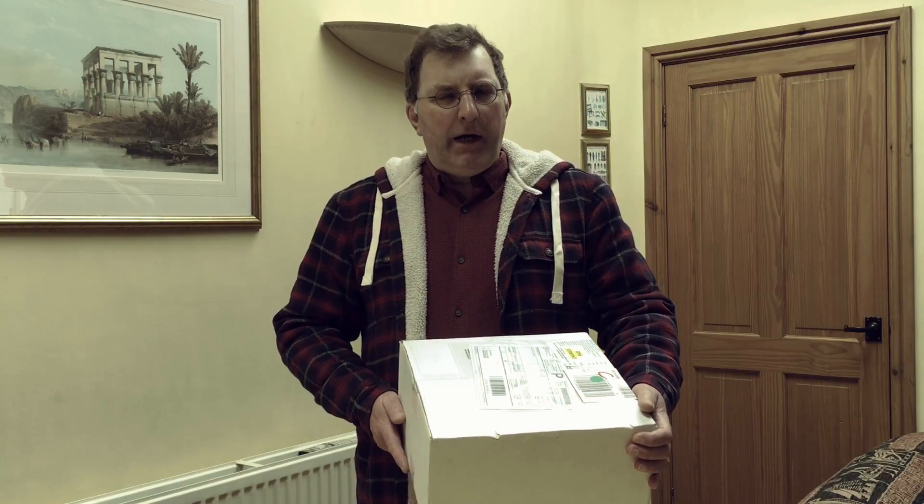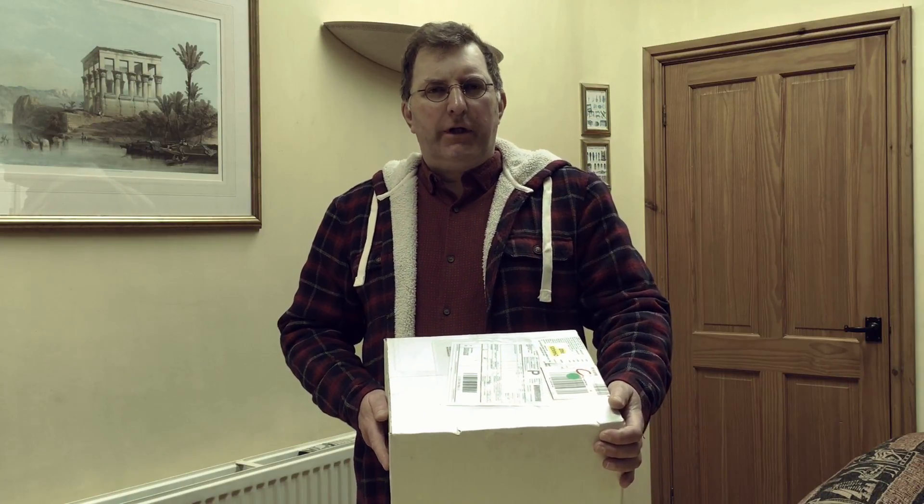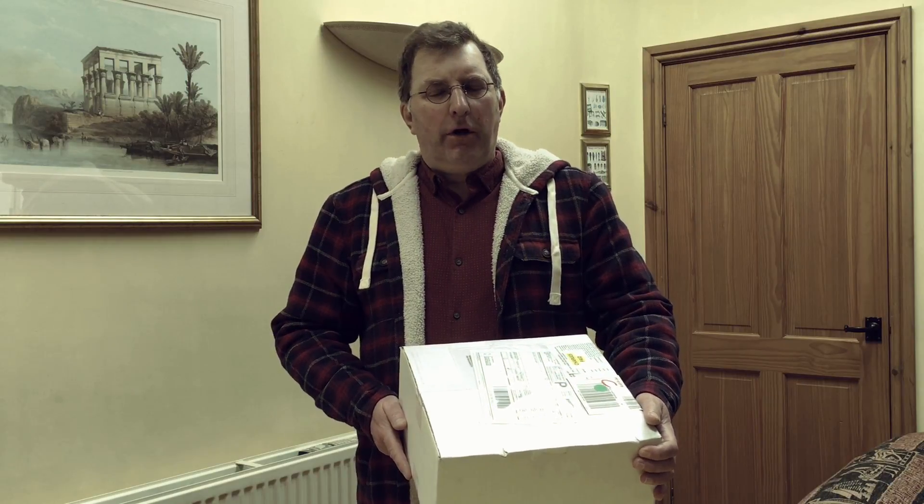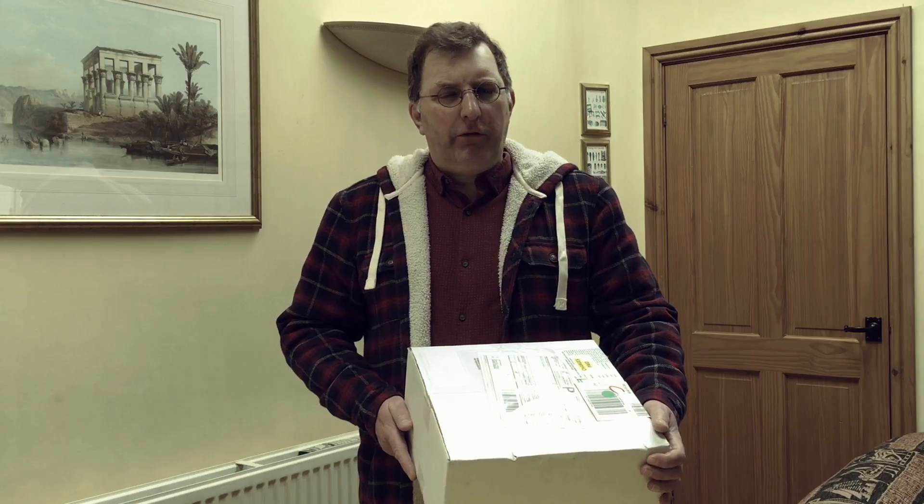I've decided to take up biohacking, which is amateur genetic engineering, because I came across this company online, the ODIN, which I think stands for the Open Discovery Institute.